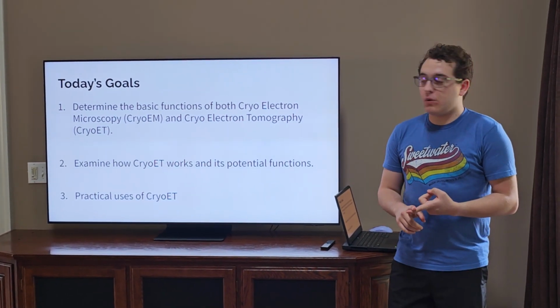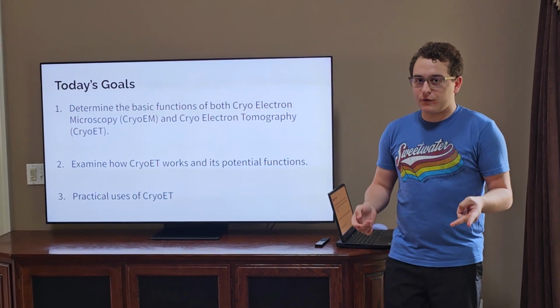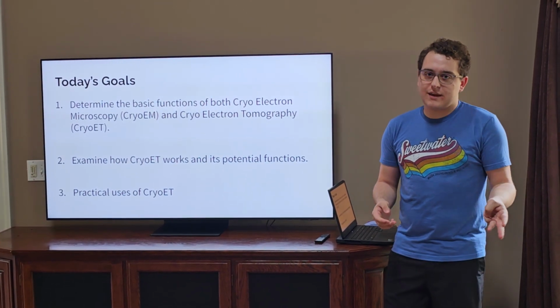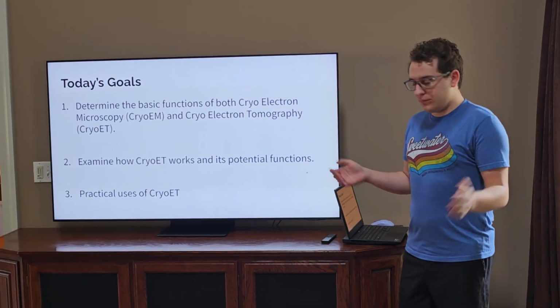So first, we're going to determine the basic functions of cryo-electron microscopy and tomography. We're going to talk about how these work, and then we're going to talk about the practicality of it. So why does it matter to anybody in the room?